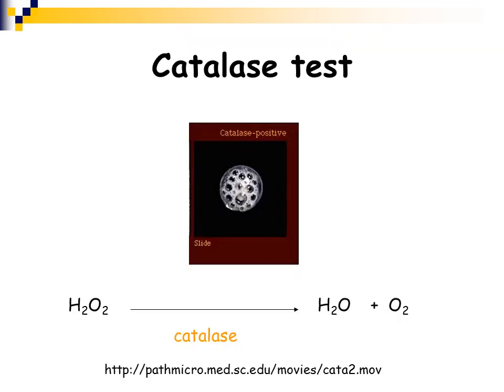So you can go to this website. I put a link on your course site page, and you can see the catalase reaction. For those of you that have never been in a clinical microbiology lab, or if you didn't do catalase tests in your general microbiology laboratory, you should go in and watch this video. It's a very simple test. It takes 2 seconds, and it is one of the few manual tests that are actually done in the clinical laboratory.